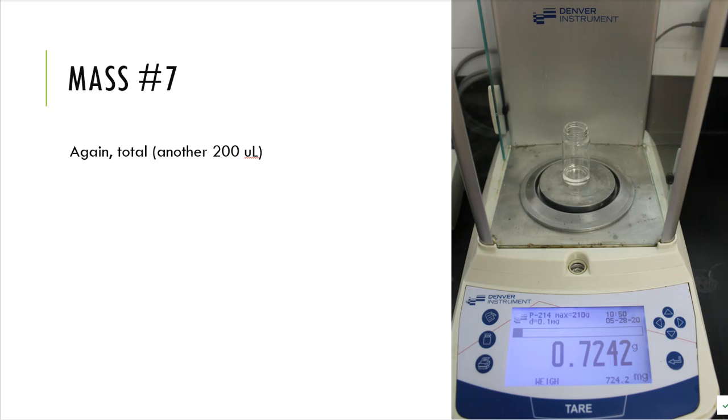and get your laboratory notebook together. You're also going to see another video. I'm going to focus on just the grade sheet in that one. This is probably the first time that you will be handwriting a laboratory experiment in a notebook with me. And I like to do the grade sheets to kind of give you some insight on what you should be writing down, what kind of statements need to be included, and so forth, and give you some general guidelines of laboratory notebooks as well. So that's what you're going to see in a separate video. If you've got questions about the grade sheets, that's where you're going to find those.